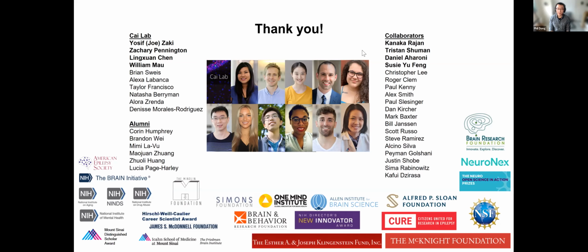Yes, that's a good question. So usually what we do in lab is that we do some visualization for 1 or 2 sessions from the same animal, and usually the parameters are almost identical within the animal. So as long as nothing crazy is happening, we try to make sure all the parameters are the same for a single animal at least.